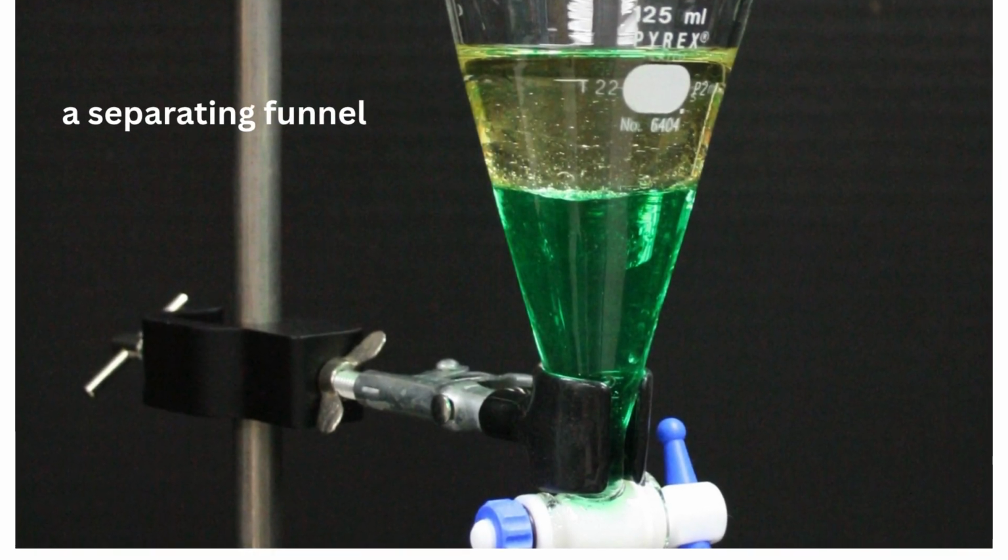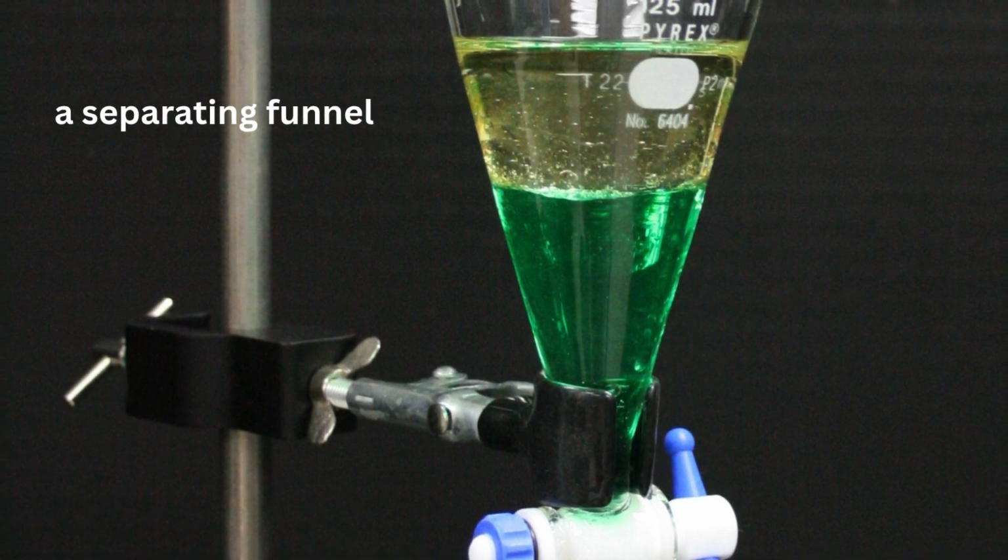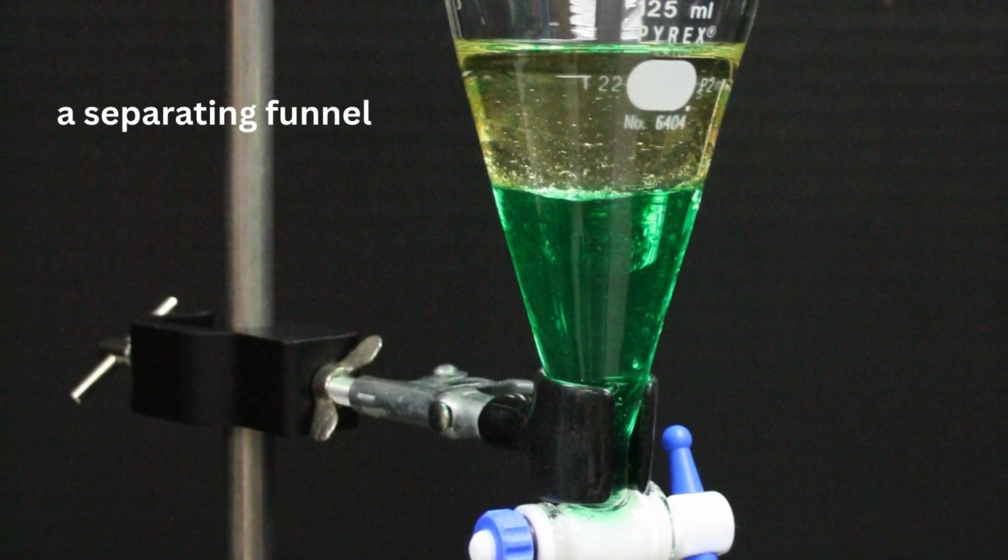So next is how to separate immiscible liquid mixtures. We separate immiscible liquid mixtures using what we call a separating funnel. You will find this equipment in school laboratories and everywhere else where they are separating immiscible liquid mixtures, like people who get oils from trees and plants.